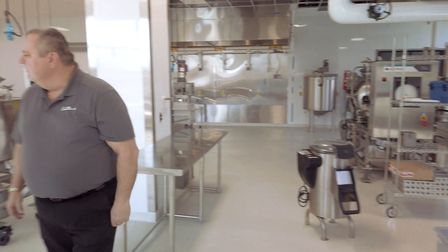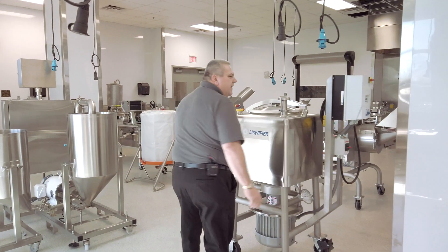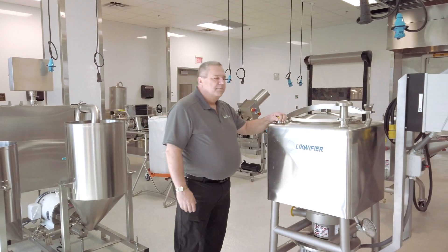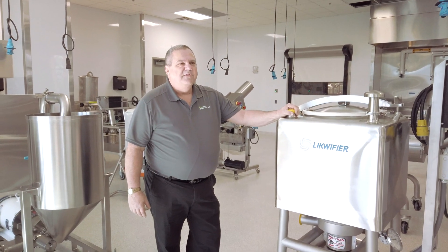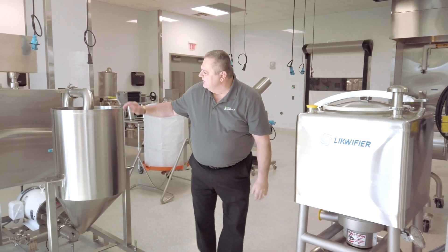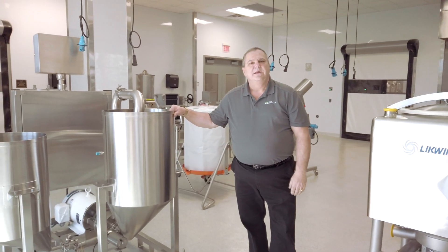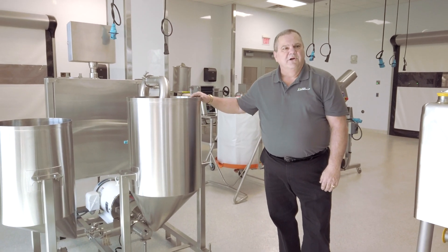From there the processing can move in a number of different directions. We can puree our products in this liquefier — it does quite a nice job of making 50 pounds of soup in a blink. We can also take it here and make hummus, mayonnaise, or salad dressings in a high shear emulsion pump.